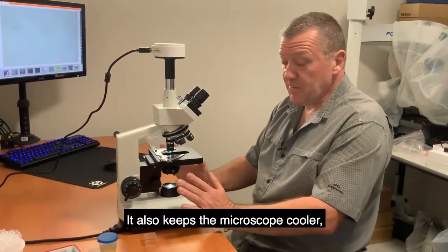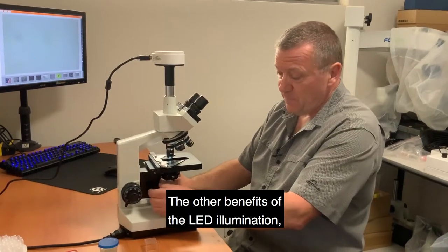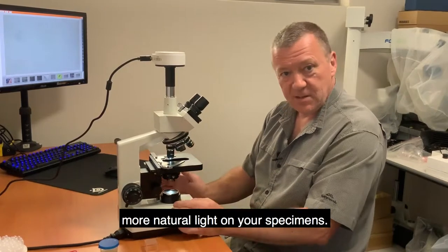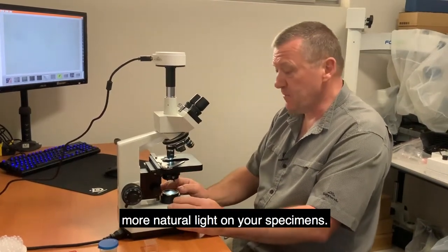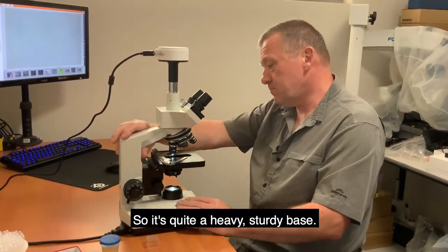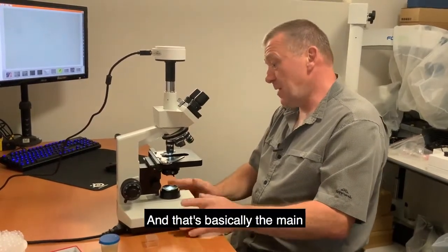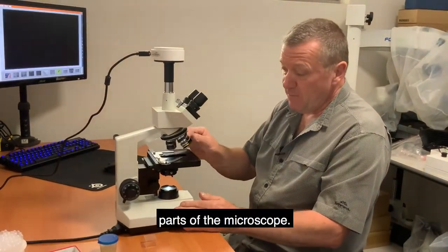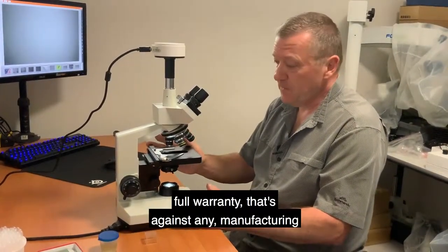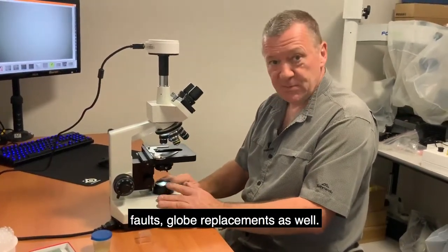LED also keeps the microscope cooler with lower power consumption. It gives you a much clearer, whiter, more natural light on your specimens. This is an all-metal construction — a heavy, sturdy base. We cover all our microscopes with a five-year full warranty against any manufacturing defect, and globe replacement as well.